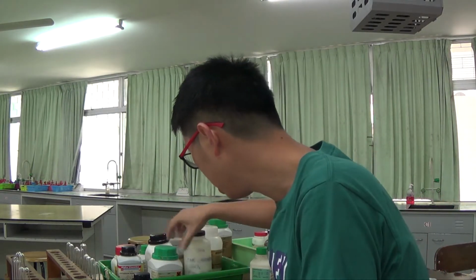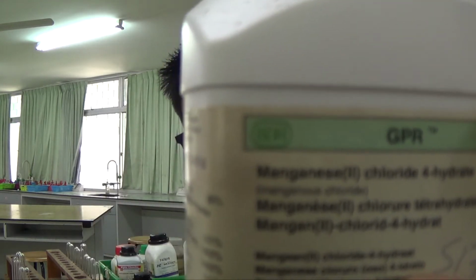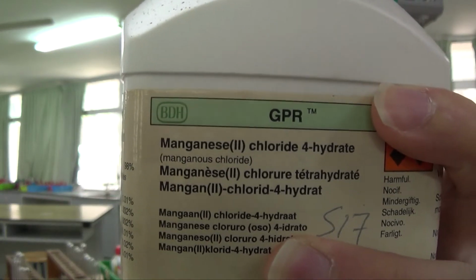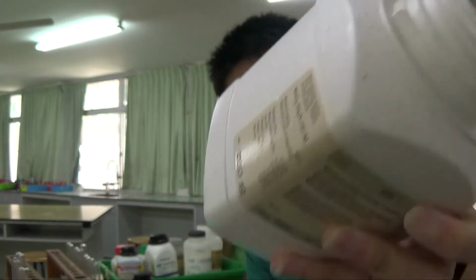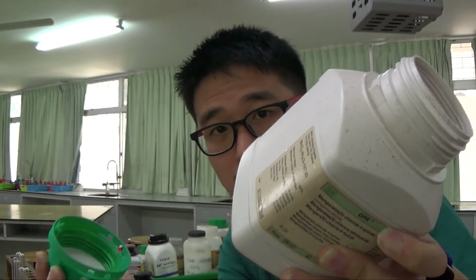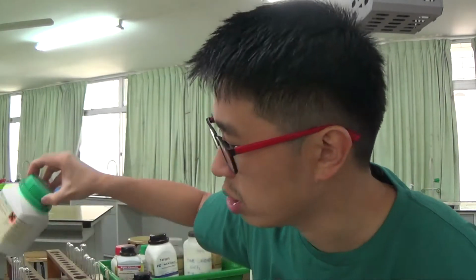Looking for manganese. This is manganese 2 chloride. Not too sure if it's clear or not. Okay, it's autofocus now. This is also a hydrated salt. Manganese 2 chloride. As you can see, it's a pink color solid. It will give you a pink color solution. Anyway, so it's a pink color solid, Mn2+ being an ion of the transition metal.